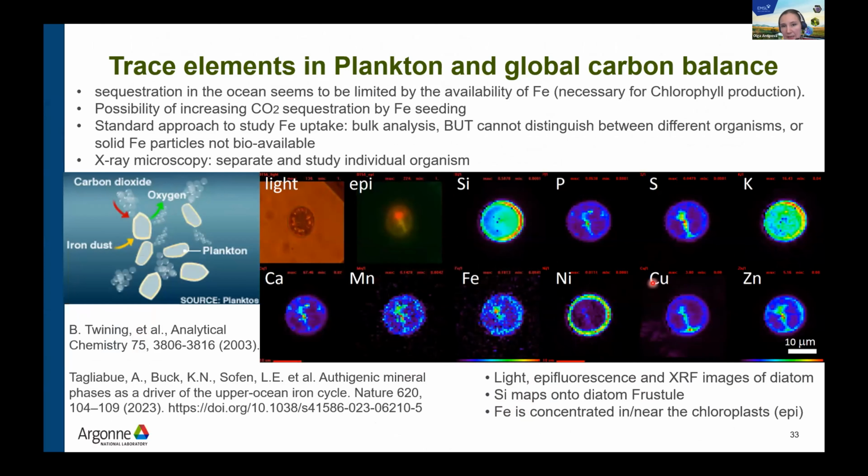And last but not least, we also look a lot at algae and plankton. It's an ongoing collaboration with Benjamin Twining from Bigelow Laboratories. Plankton is very important for carbon sequestration. It depends on iron availability. It kind of feels like an endless study, but it generates a lot of data which can be useful for different kinds of modeling of carbon sequestration and oxygen production by the ocean.